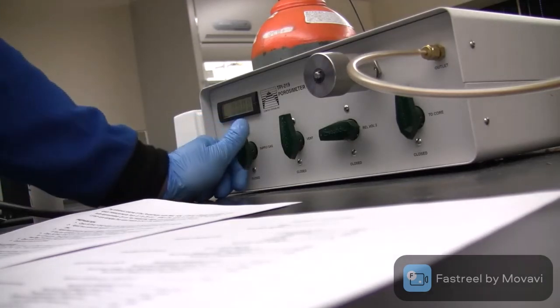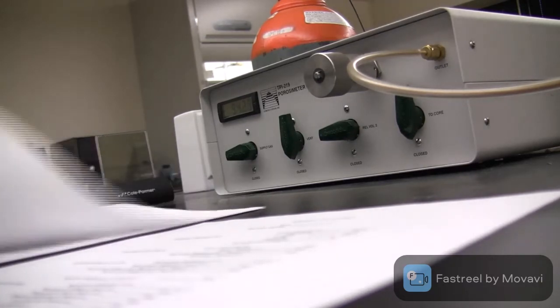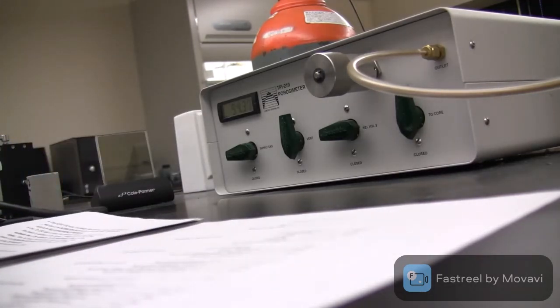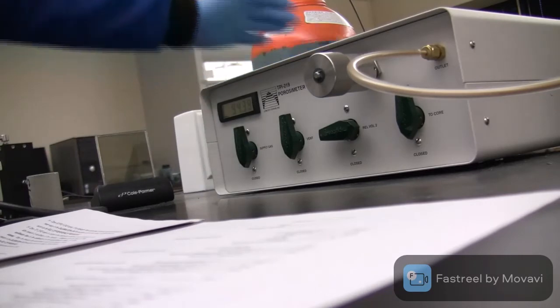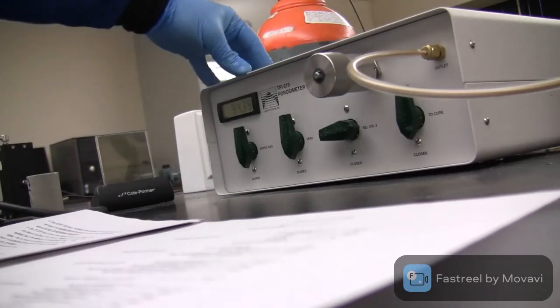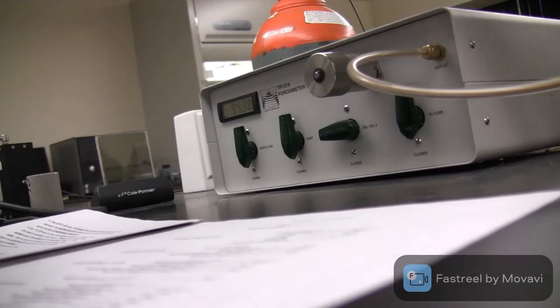So let's open our supply gas valve, and it would take us to almost 95 or 94, close to the pressures that we had. So next step is, after leaving it for some time, we close the supply gas valve. So now we prevented any connection between the gas cylinder and our chamber. Now I'm going to open the connection between the first chamber and my chamber that's full of pellets.